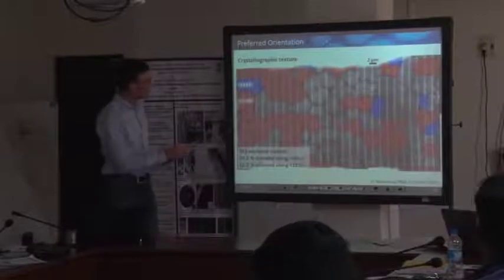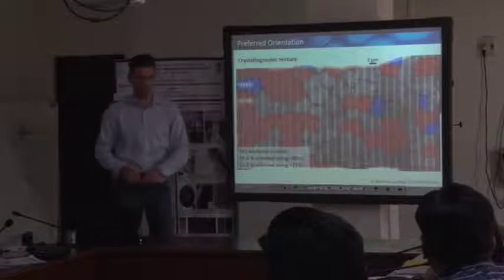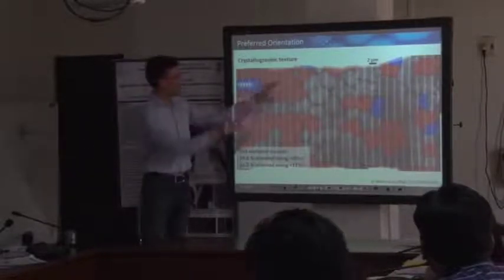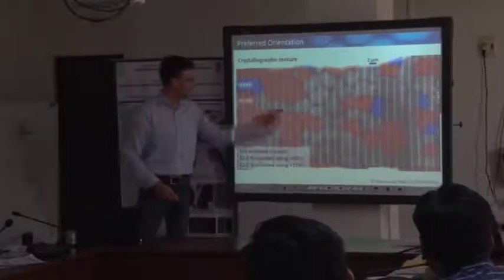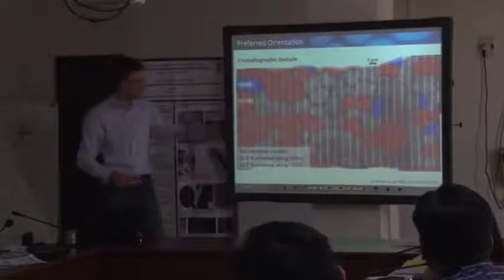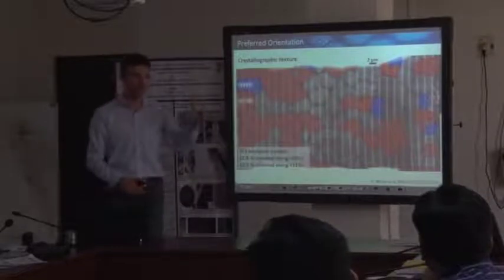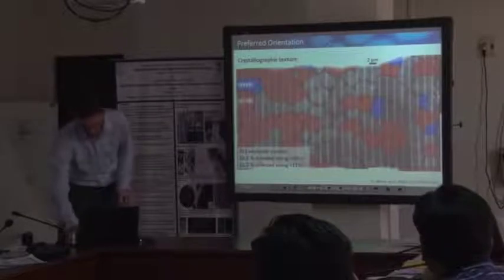You can even derive some texture mapping, for instance. People who work on metals can easily understand what that is. Just by looking at those crystallites, you see that some are already aligned very nicely in some highly symmetrical direction with respect to the surface of the wing scale. And this is what gives us this bright color in a certain angular range of such a butterfly or an insect.